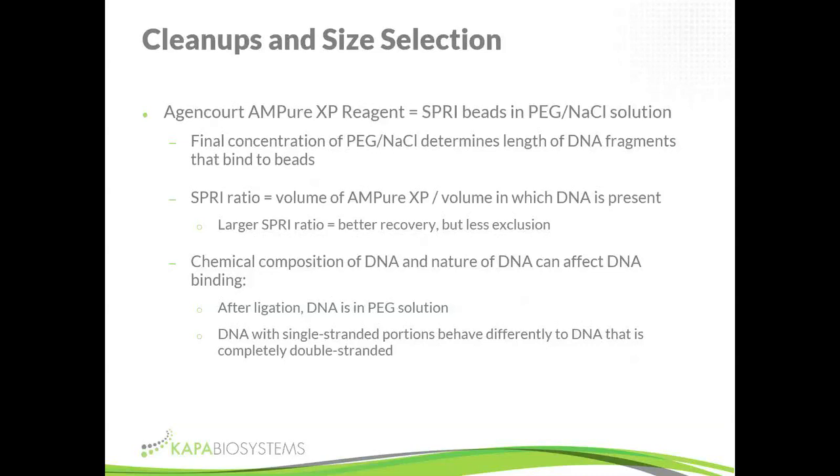Some of this is well worked out, so you don't have to worry about it so much. We provide good instructions for what to do. Also, for instance, double-stranded DNA versus partially single-stranded DNA bind a little differently to SPRI beads. So again, in terms of practice, we provide really good instructions, but just understand that SPRI bead cleanups aren't fixed things. There are a lot of variables that determine what's excluded, what binds to the beads, and the efficiency and recovery out of a SPRI cleanup.